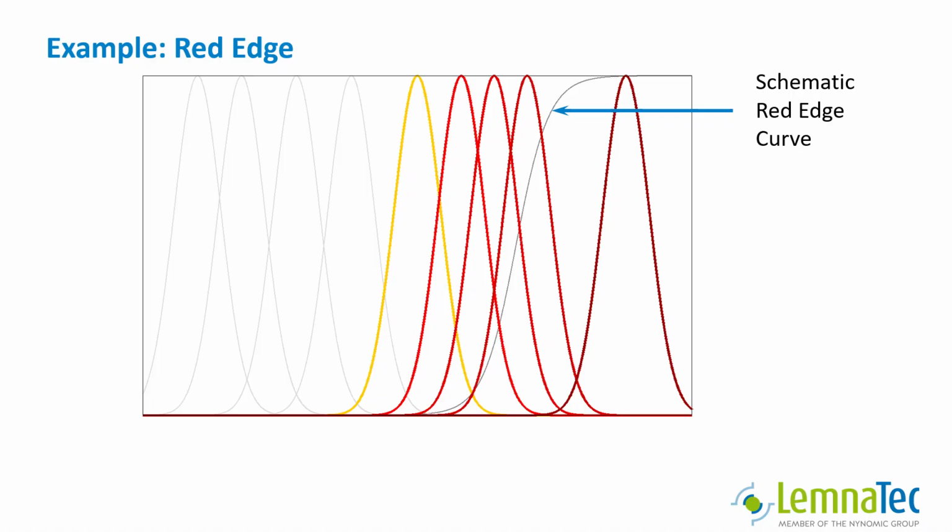You may even be able to derive an indicator for some condition from it. For instance, the red edge might be shifted towards NIR under certain conditions. In this case, the signal in the far red channel is reduced and you may use this as an indicator.